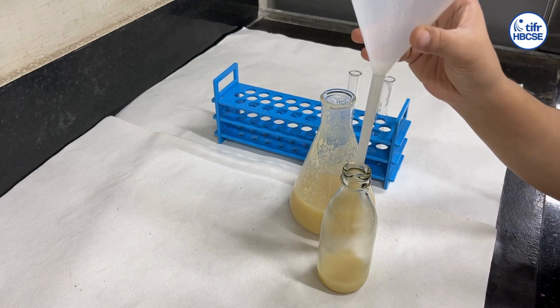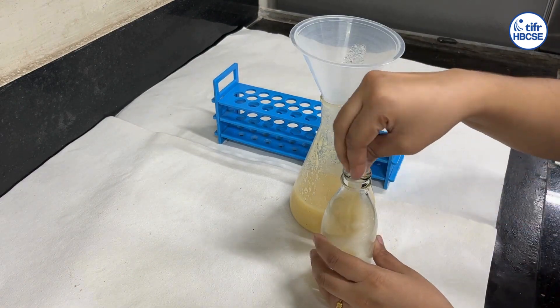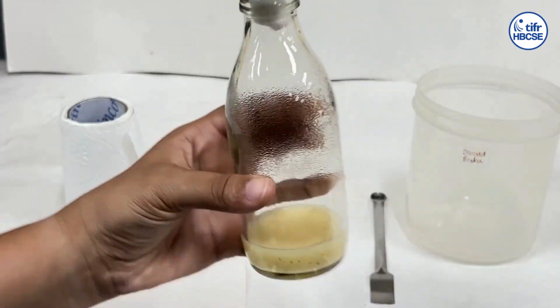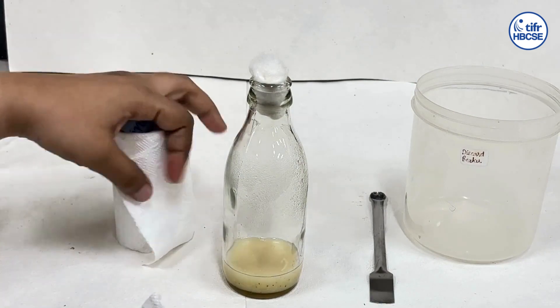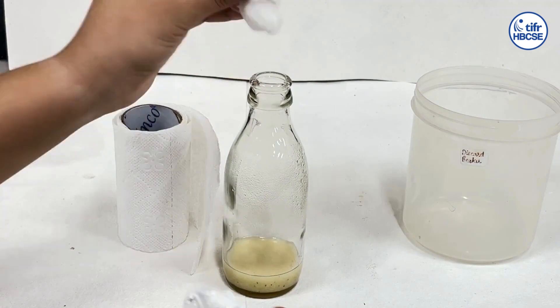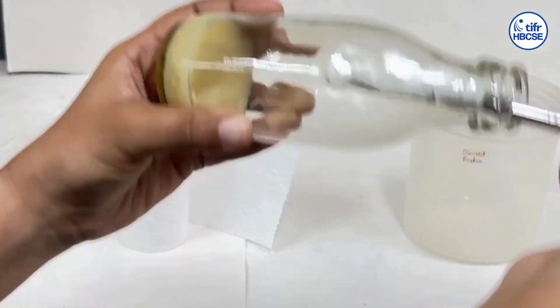Plug the bottle with cotton. Allow the medium to cool down and solidify. Wipe condensed moisture from the walls of the bottles using a small spatula wrapped with autoclave tissue paper.